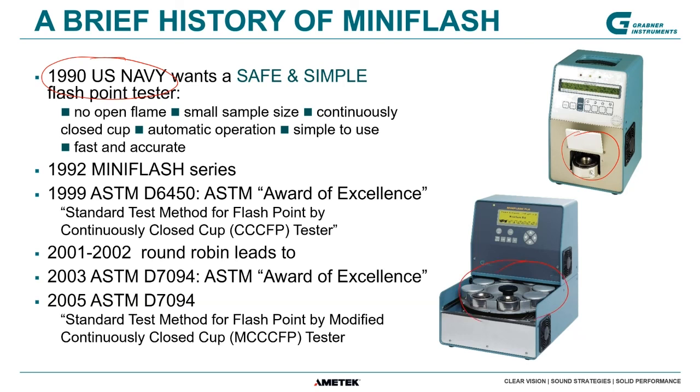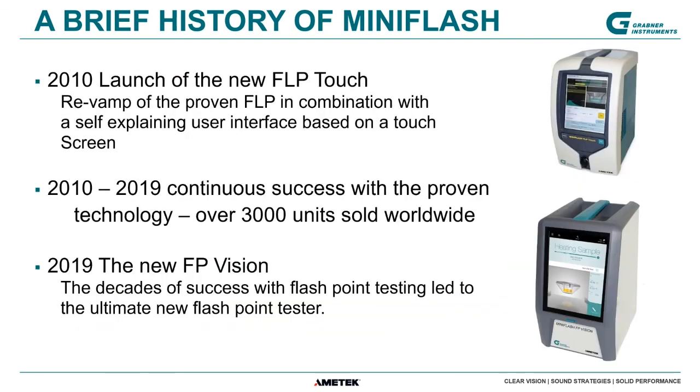We also have created a standard 6450 and 7094. And the standards are called continuously closed cup flashpoint test or modified continuously closed cup flashpoint testers, and are meanwhile used in many fuel specifications.